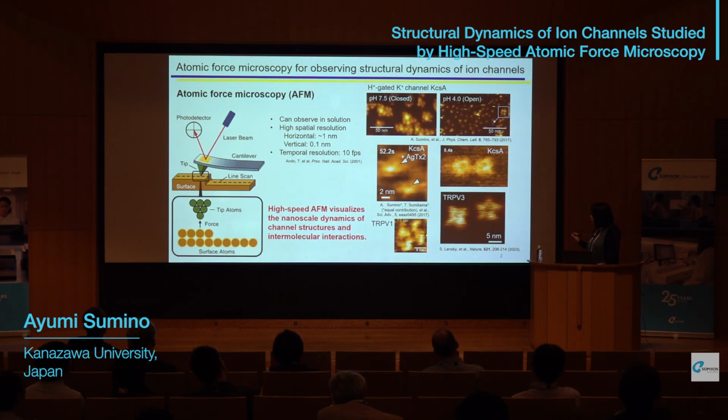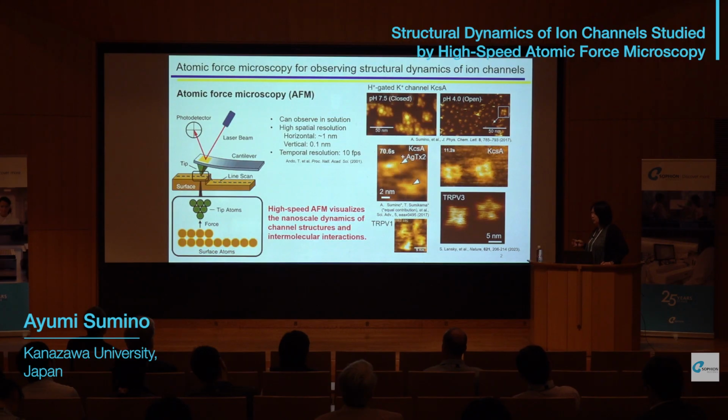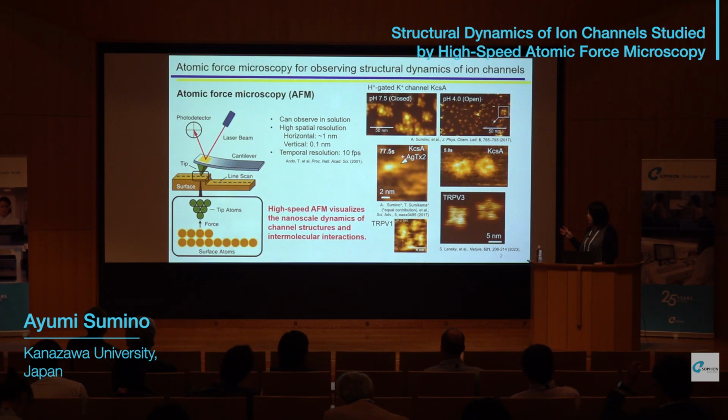And here, I observed the thermal fluctuation of the TRPV1 channel in reconstituted membrane and found that the molecular fluctuation depends on ligand binding in this case. So I mean that the high-speed AFM can visualize the nanoscale structural dynamics of ion channels and their intermolecular interaction like this.